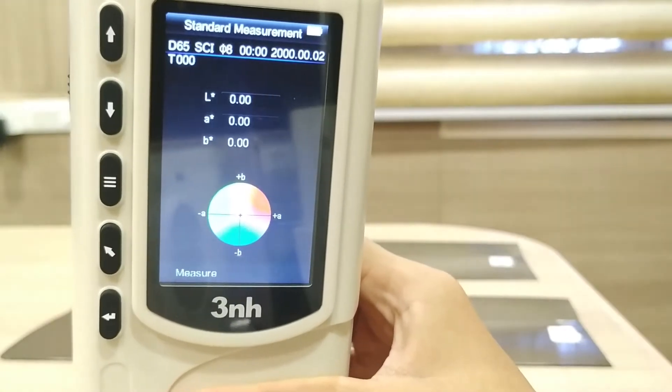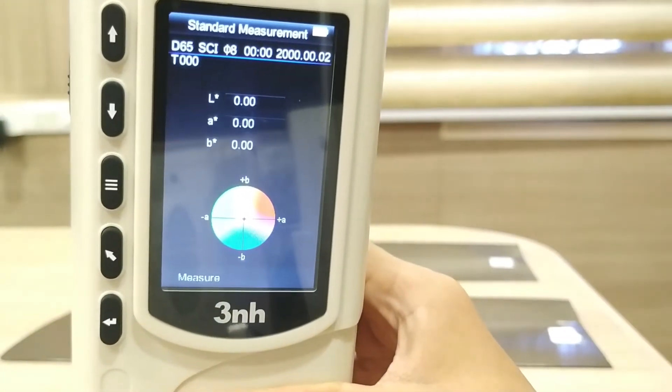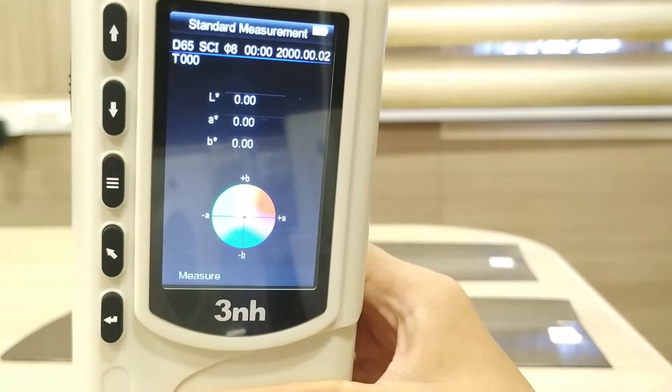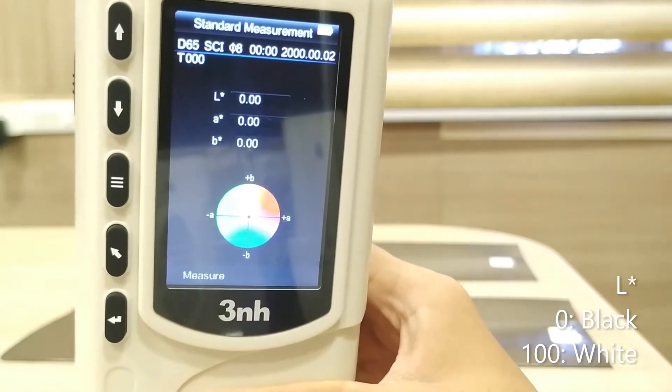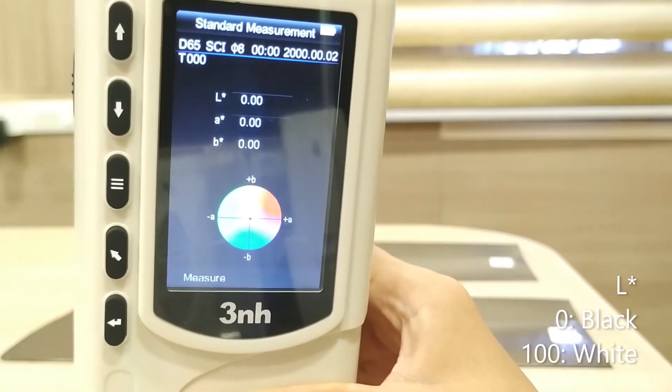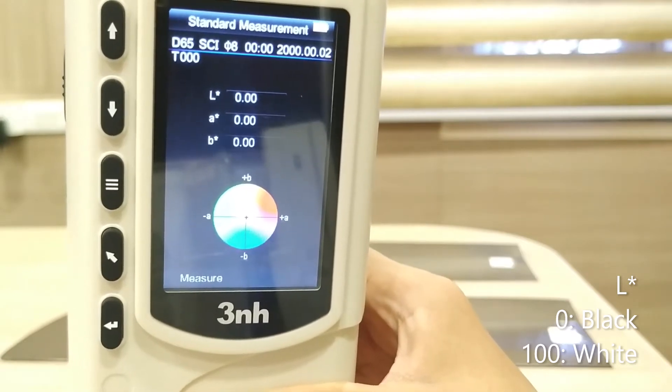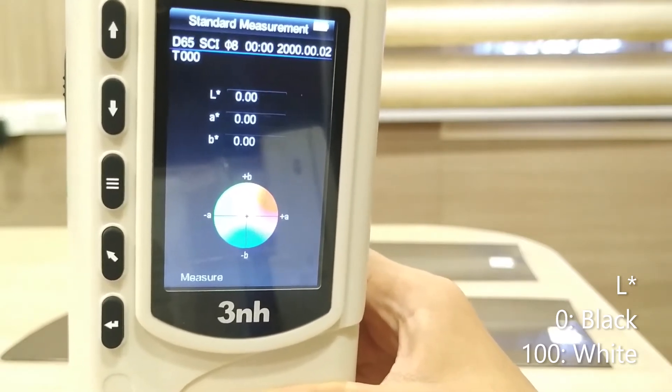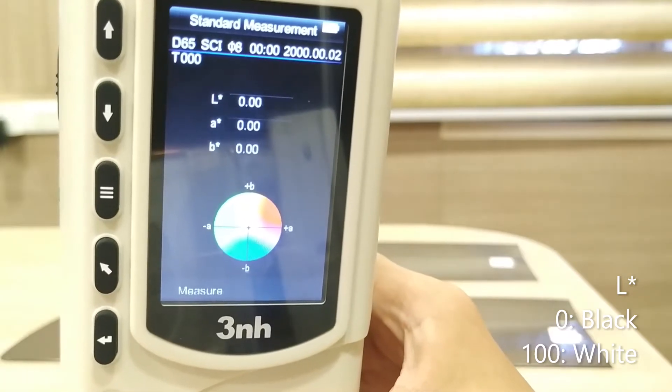This instrument uses the LAB color measurement scale. The L represents black to white, and the numerical range is from 0 to 100. This means that 0 indicates black and 100 indicates white color.